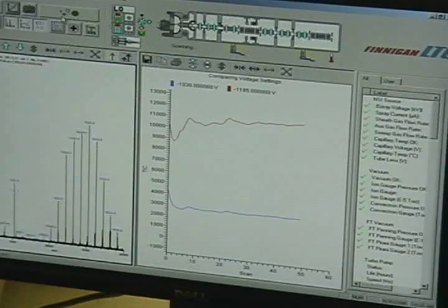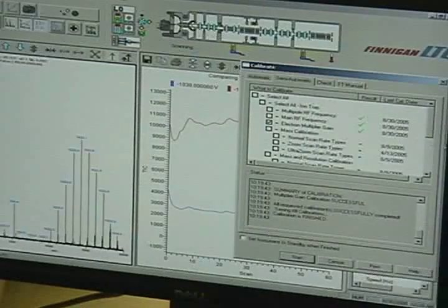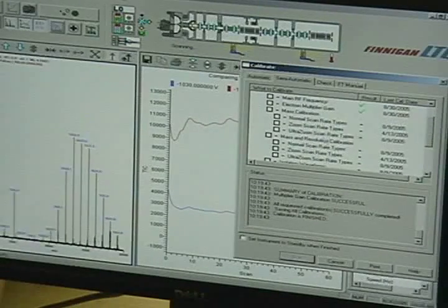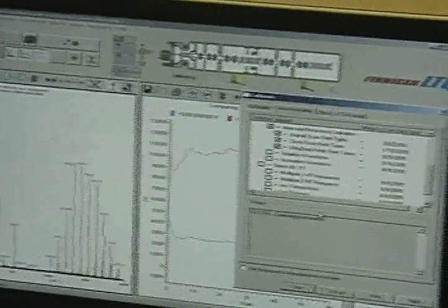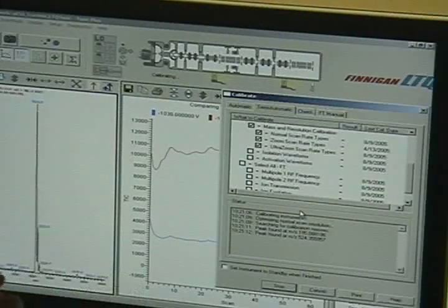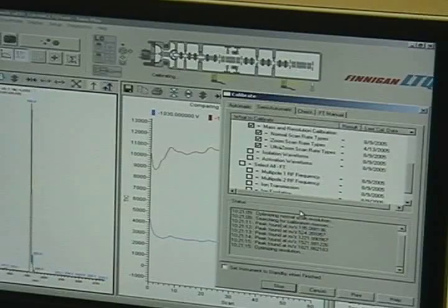We never use it, so I don't care. Well, I want you to pass it. I want to feel like I know that your instrument's really working. If not, eventually I want to get you an engineer to fix it. So now it's going to go find the 5 masses and make sure it can see them properly.